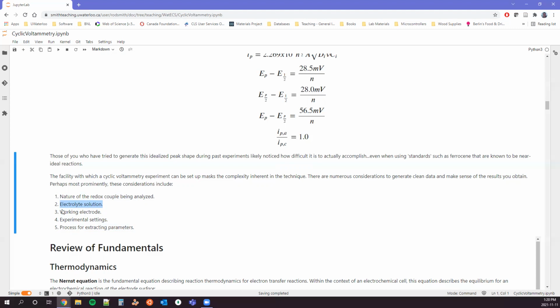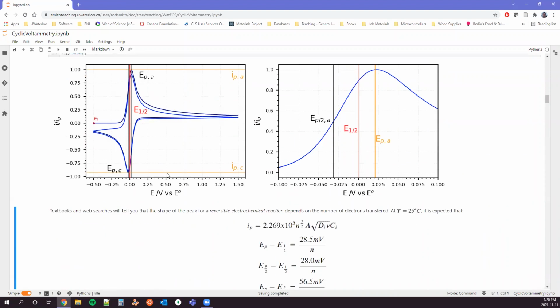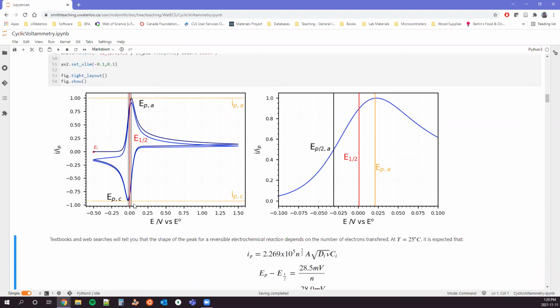Whether or not you have a protic solvent or an aprotic solvent, all of this is going to affect exactly what you see. The identity of your working electrode, the kinetics for the electron transfer can be tied to that working electrode, whether or not there's a specific interaction. Your experimental settings, which are our primary tool that we're going to use to play with it. And your process for extracting the parameters, right? If we look at this IPA over IPC again, very clearly we can't just take the hard number. And so we have to process this data somehow.